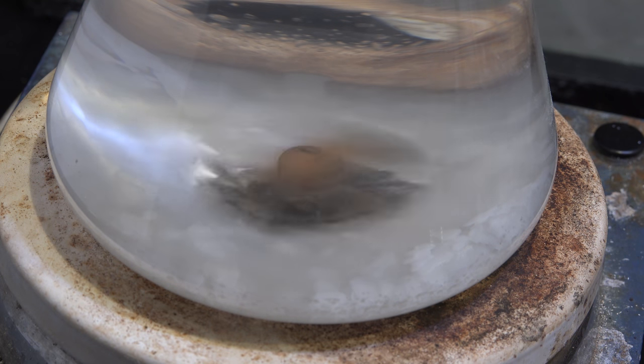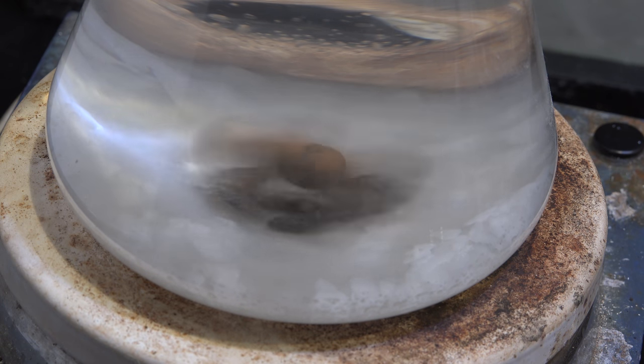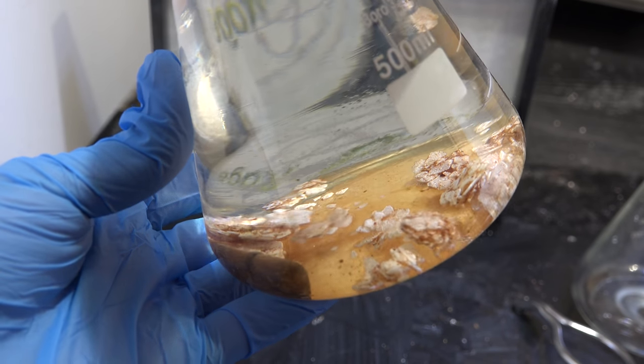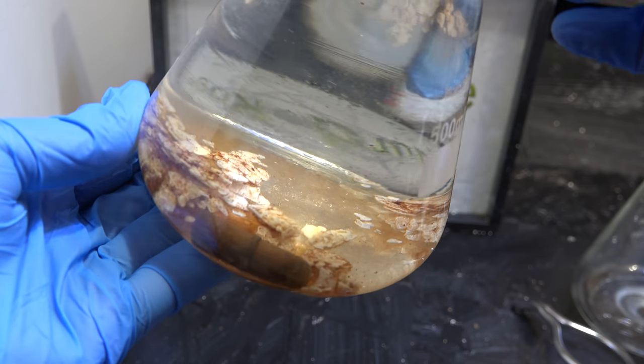I'm going to let this stir overnight. I also stoppered the flask with a glass stopper to prevent evaporation. Here we are the next day. You can see most of the impurities have been pulled out by the potassium hydroxide, and some of it has turned brown due to various condensation reactions initiated by the potassium hydroxide — good thing it's all separated into another layer.